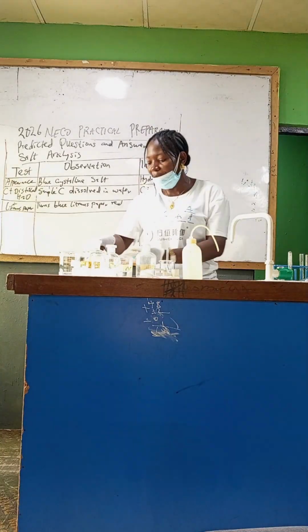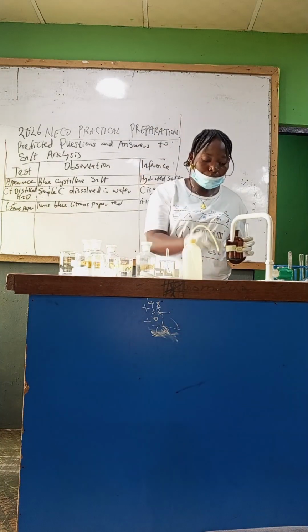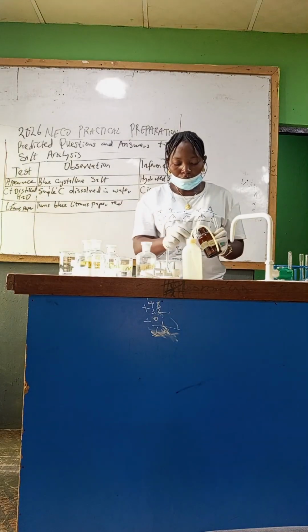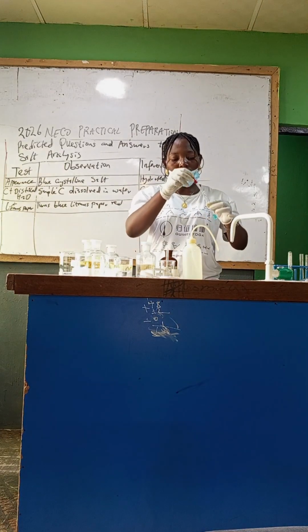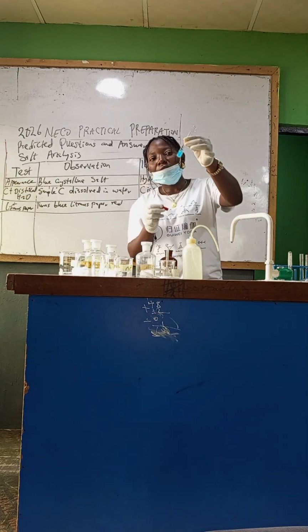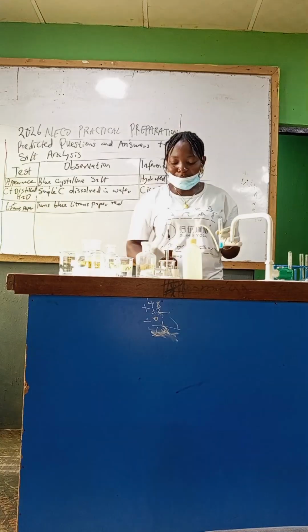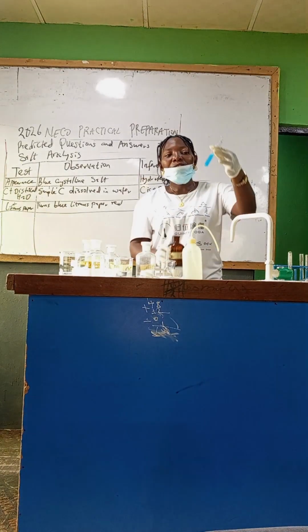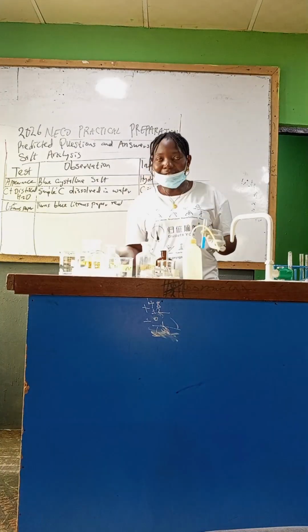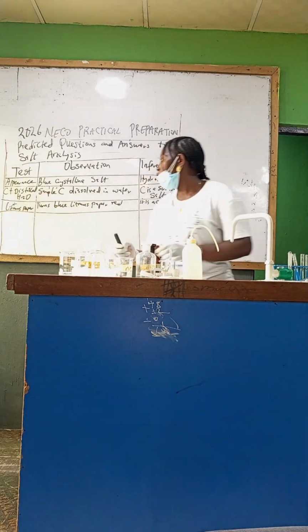This is sodium hydroxide, in drop. Can you see it? Pale blue gelatinous precipitate is formed, insoluble in excess sodium hydroxide.